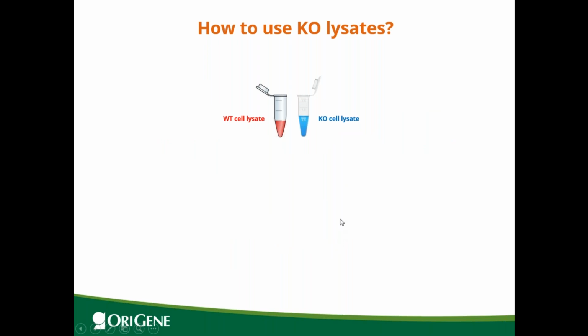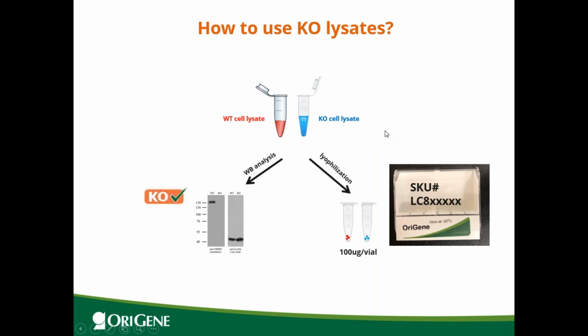How do we use this lysate? This lysate can be used to verify the specificity of antibodies in the Western blot analysis. It can also be lyophilized and sold as a standard lysate product for customers.